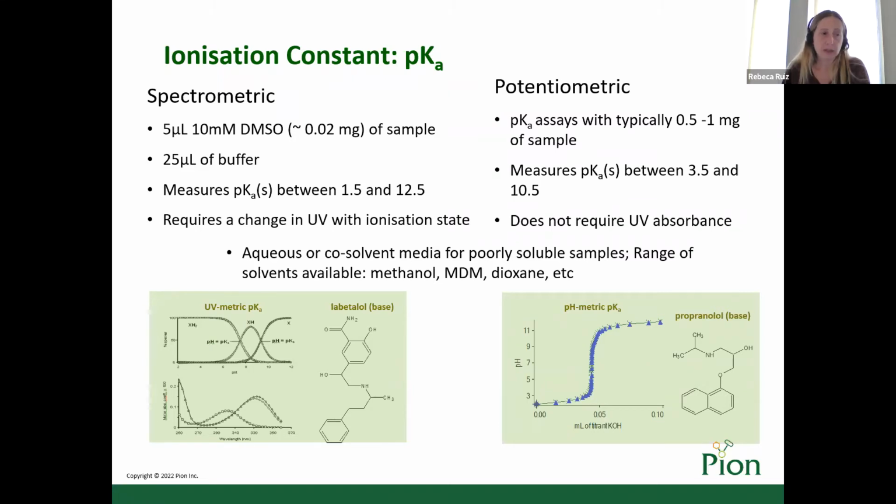This technique measures pKa's between 1.5 and 12.5, and sometimes even lower and higher than this range. And only UV active and ionizable centers could be determined.